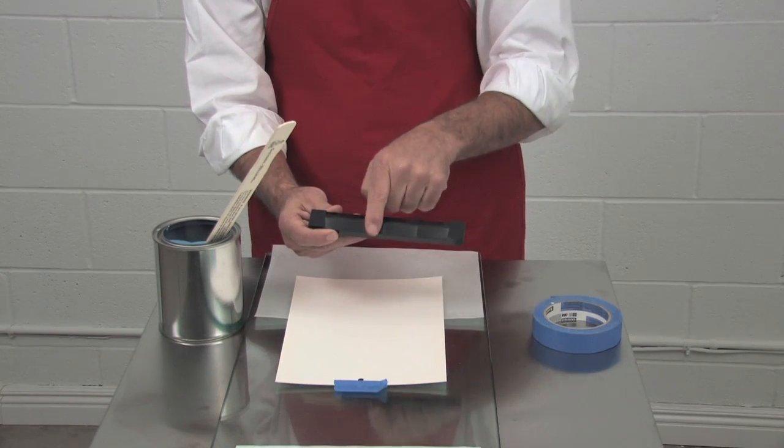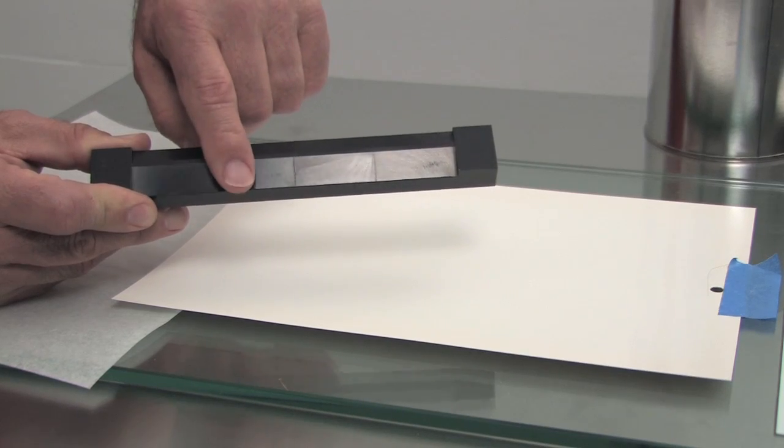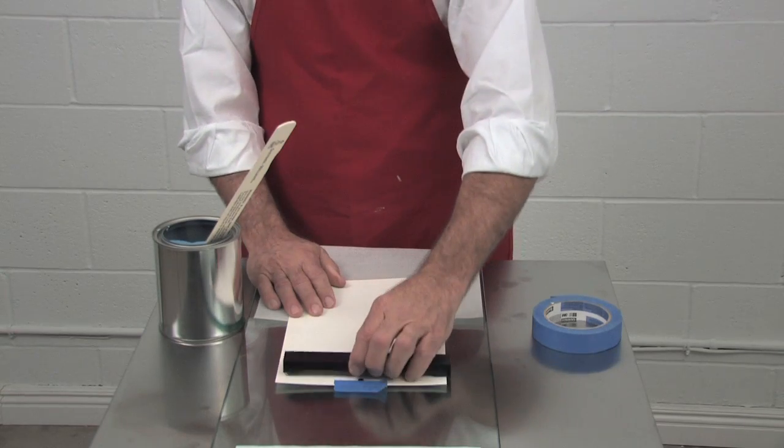Also there are two flat planes on the drawdown bar. Use the larger surface facing you — it gives you a larger reservoir of paint to pull the drawdown.